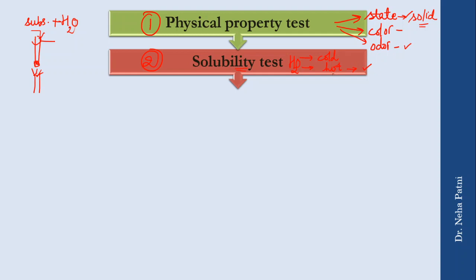Do not add excess substance — take a small amount, otherwise saturation occurs and the compound appears not to dissolve. Once dissolved in water, test with litmus paper: blue to red indicates an acid, and red to blue indicates a base. This gives a quick check of whether the compound is acidic or basic.